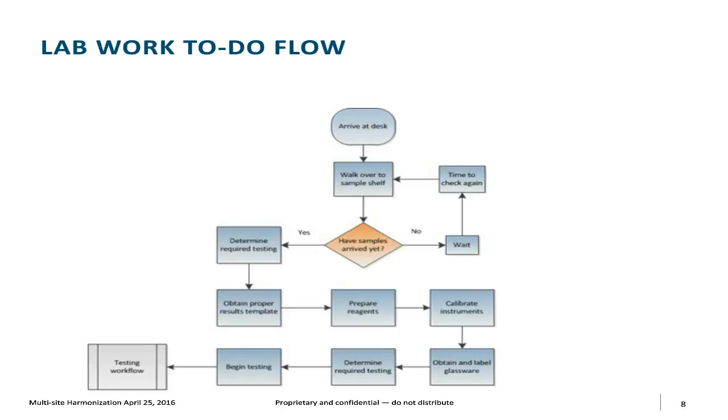So let's examine a typical workflow. Here I've taken just a very small operation, and we're calling this the lab work to do workflow. In this case, I want to make sure that you're focused on the fact that, and this is so common in many, many laboratory operations, one of the first things that we do in looking at the current state environment is we tell people, okay, here's the starting point. How do you know that there's something to do when you show up for work in the morning? And people kind of look at each other, and typically you'll see people saying, well, we have a certain bin in the lab.